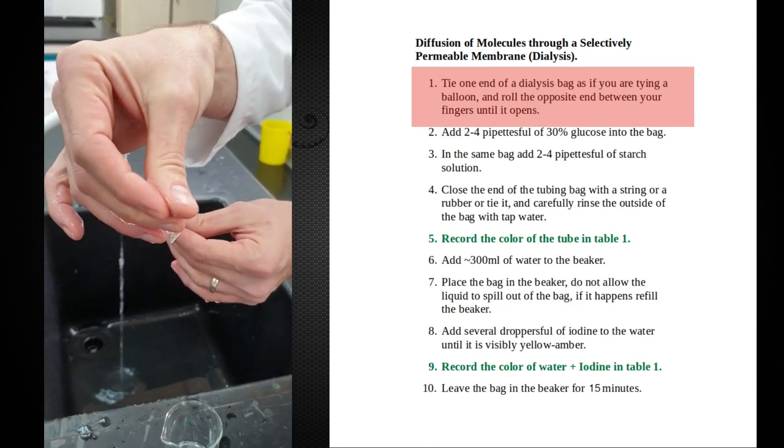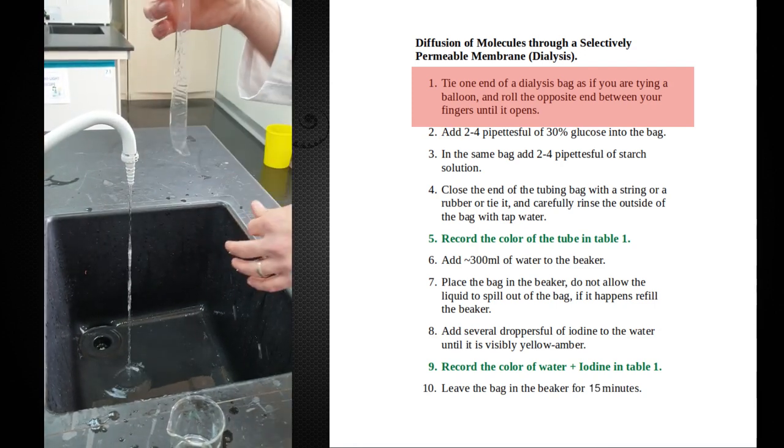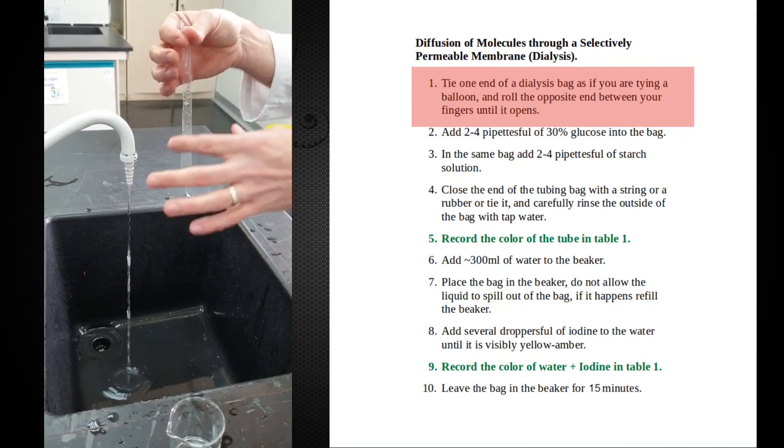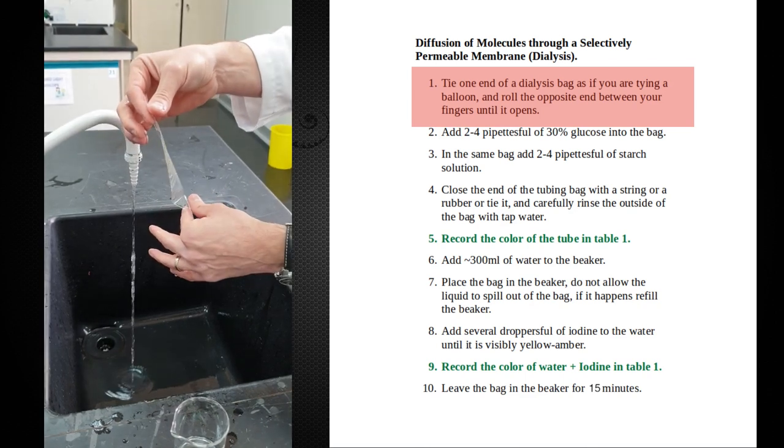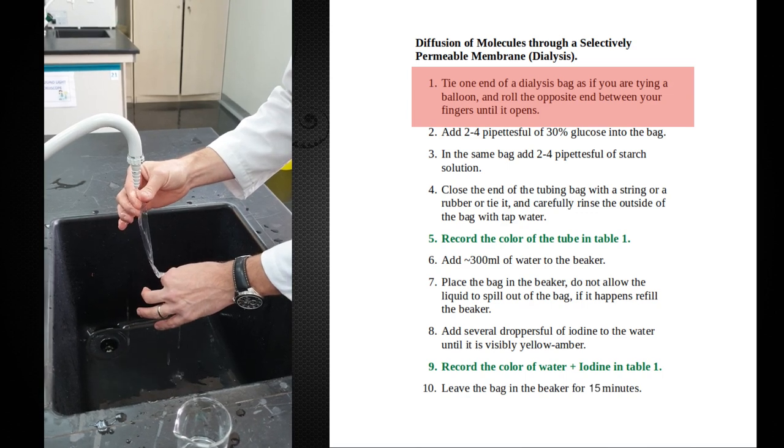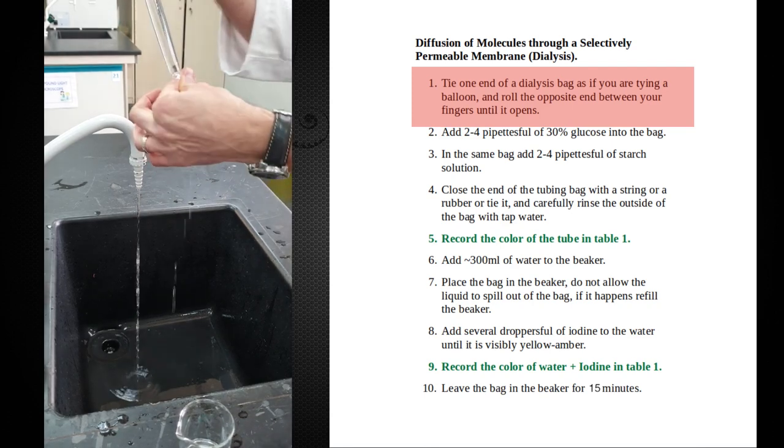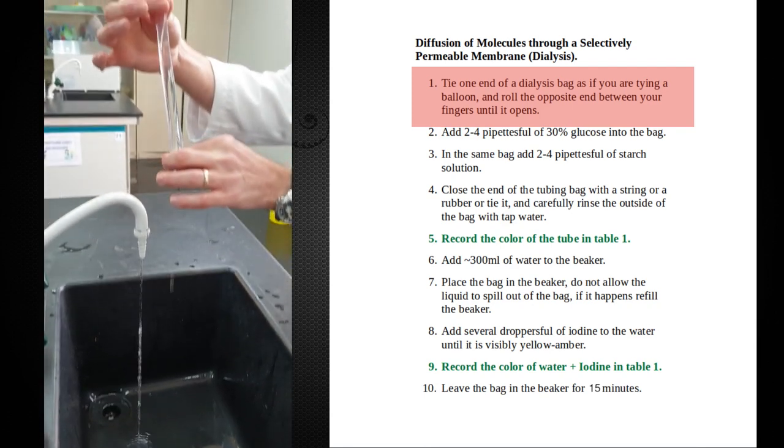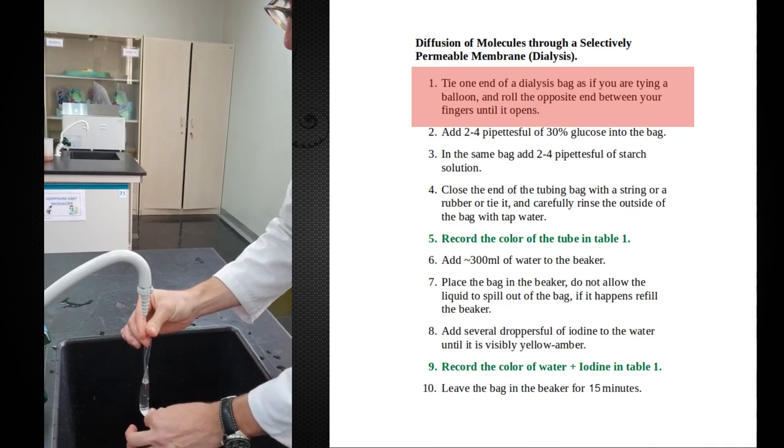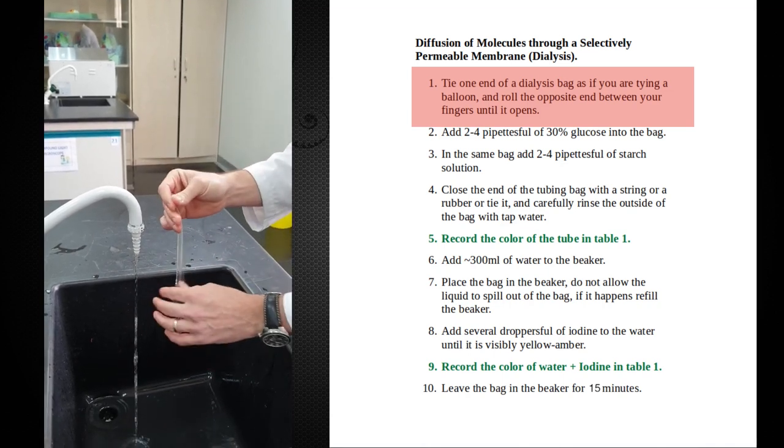The next thing you want to do is to wash it out on the inside and the outside. You want to wash out the inside as well to remove any particles that might have been there from factory processing. Plug the bottom between your fingers and open it up under the water to allow water to flow in. We have a little sausage here. Allow the water to drain through and do that a few times to rinse out the inside and outside of this tubing.